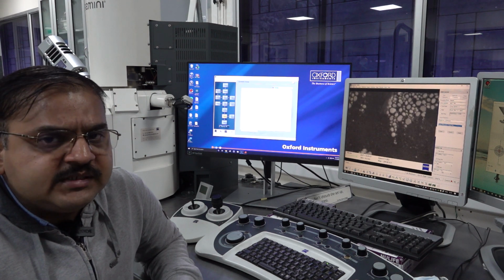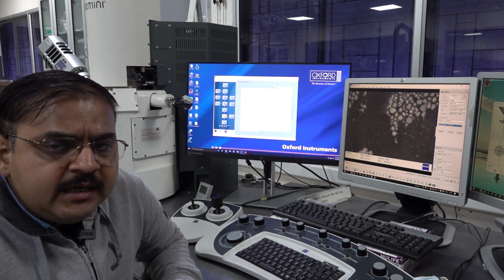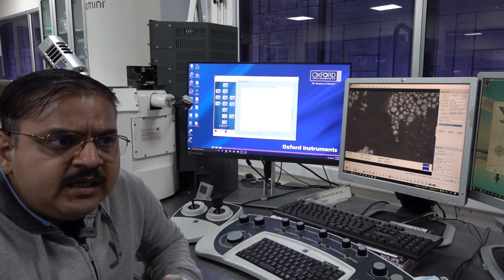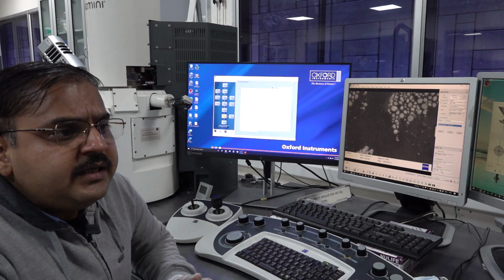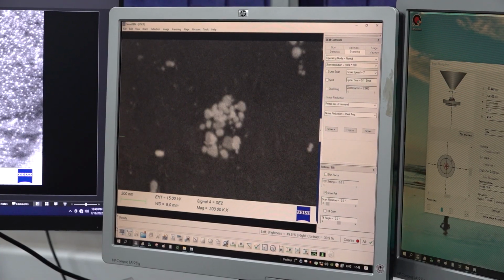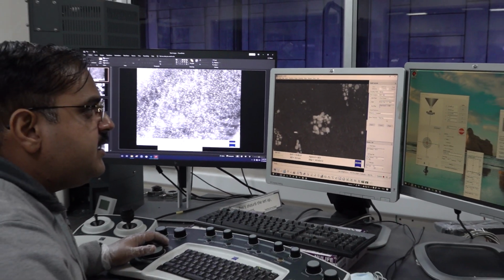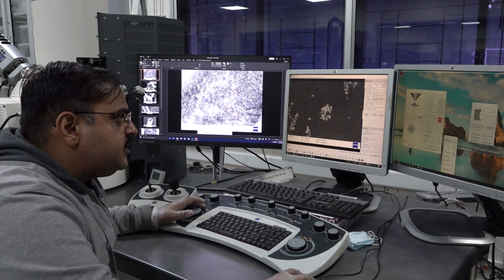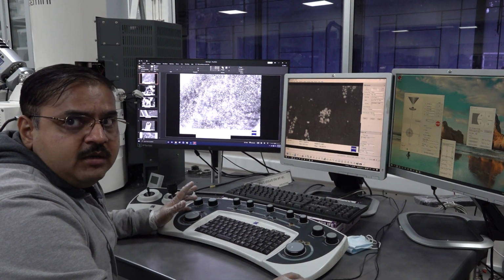Now we are going to discuss in a minute the different applications of SEM, with the different images which we have already captured and kept ready for your view, and we are going to see how to take the sample out of the chamber. So now we have already covered three different signal classes and three different detectors in order to find out the information using topographical, morphological and compositional modes.